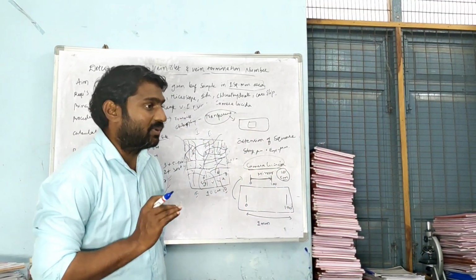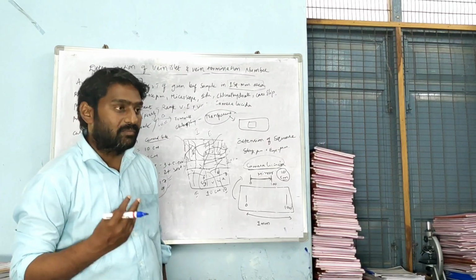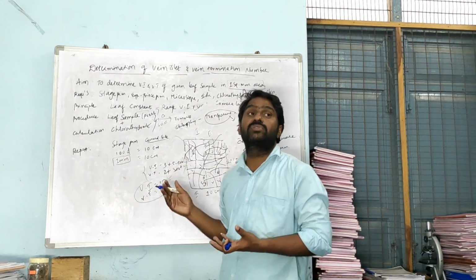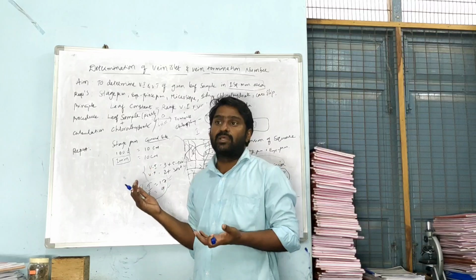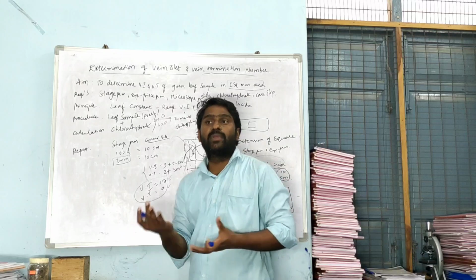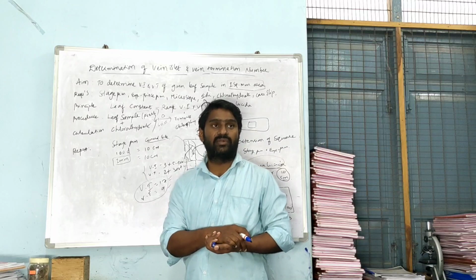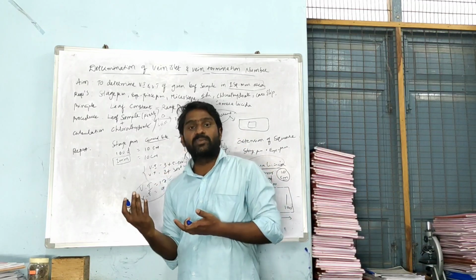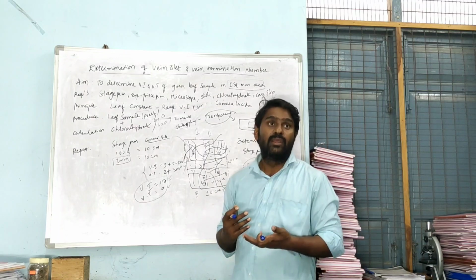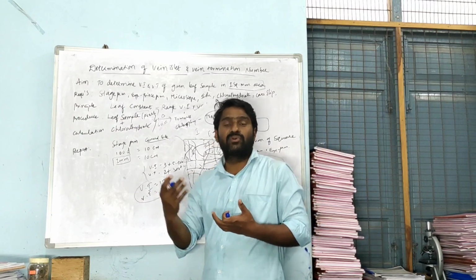If you perform it in your laboratory, you need a number of apparatus, a number of reagents, a microscope and a leaf sample. As we have a number of leaf samples, how do we choose a leaf sample? Whichever values are specified in our standard books, it may be from your textbook or from standard reference books like formularies or pharmacopoeias, whichever you refer. In pharmacopoeias or formularies, the monograph of the individual drug is given. As the monograph is given, definitely we should see that the sample is genuine, which is supposed to be used for further process.